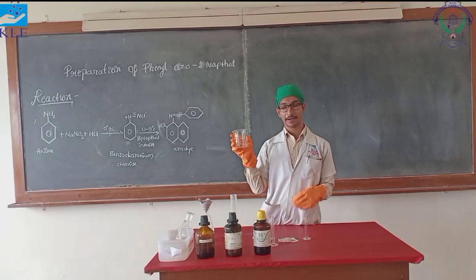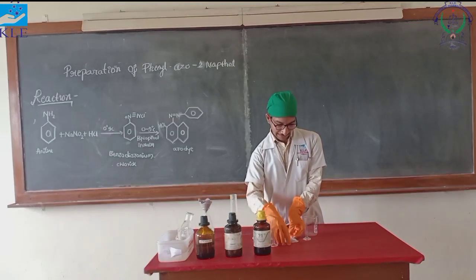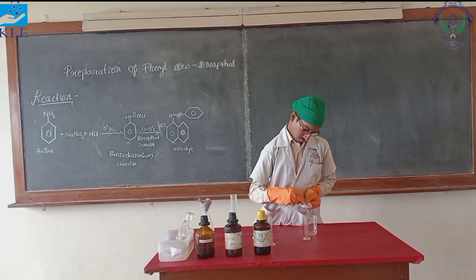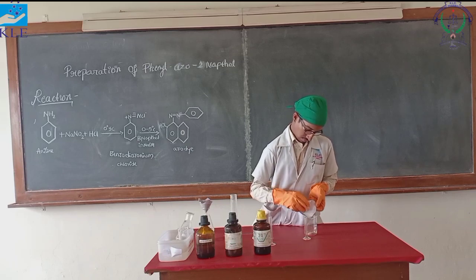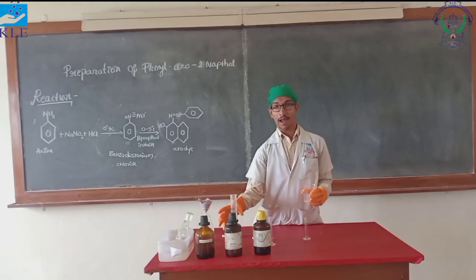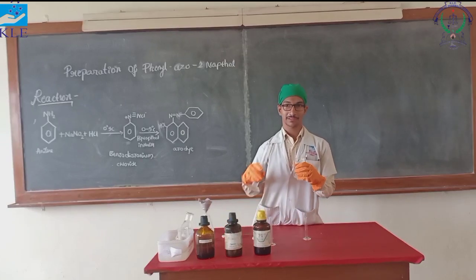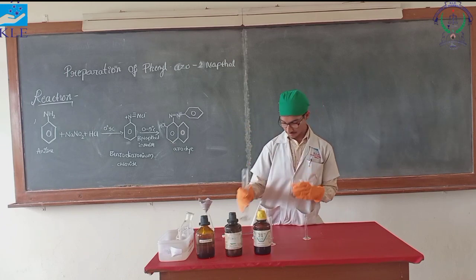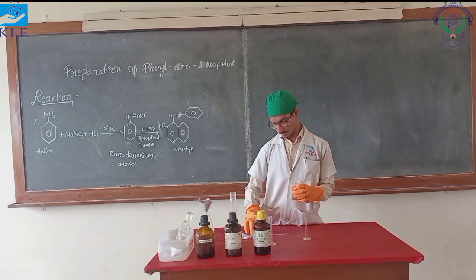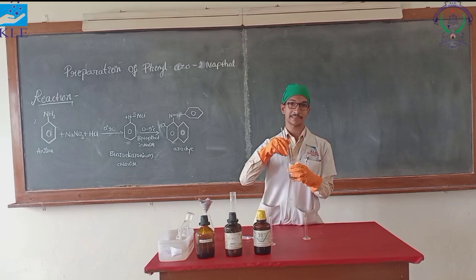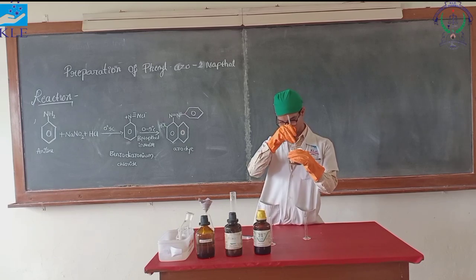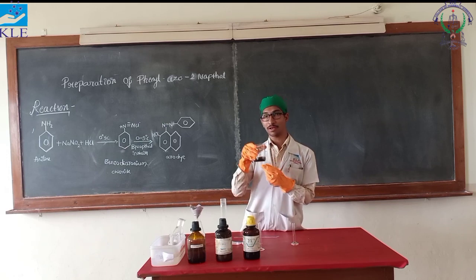Now take a 250 ml beaker. To this add a weighed quantity of 7 grams of 2-naphthol, that is beta naphthol, and dissolve it with 10% sodium hydroxide solution, 60 ml. Stir it with the help of a glass rod to make it completely dissolve in the NaOH solution. After it completely dissolves, keep it also in the ice bath.